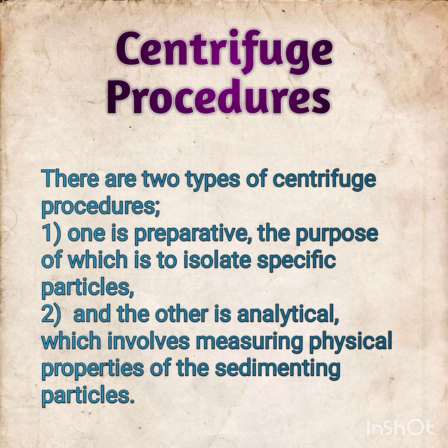Centrifuge procedures. If you are talking about the procedures of the centrifugation process, then we have mainly two types of centrifuge procedures. One is known as the preparative procedure and the other is analytical. The preparative procedure is done to isolate specific particles, while the analytical procedure involves measuring the physical properties of the sedimenting particles. This is the difference between the preparative and analytical procedures.